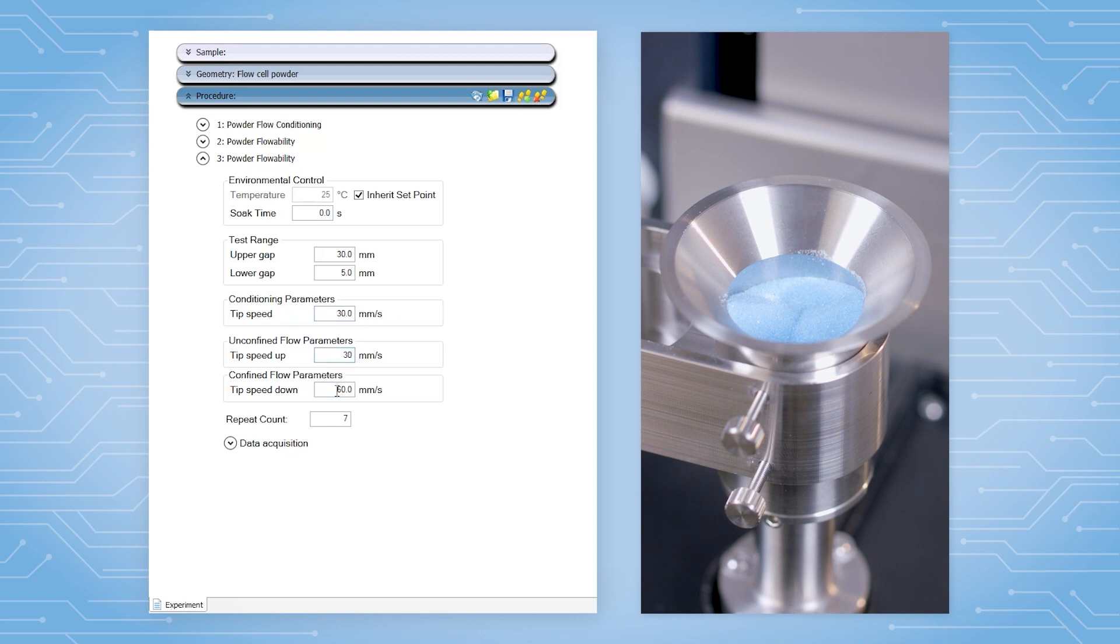To measure flow ability at different rates, add a duplicate powder flow ability step and enter the desired tip speed.